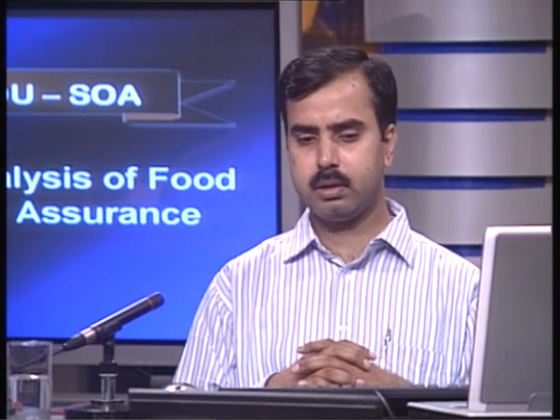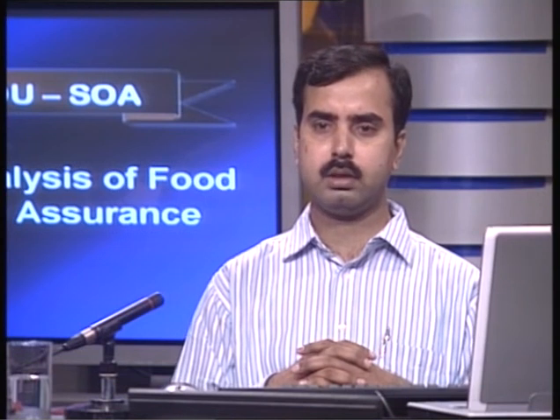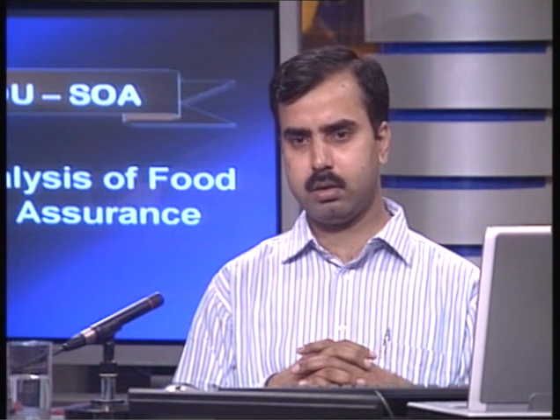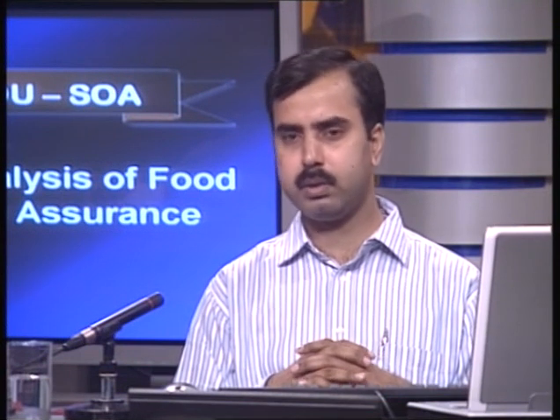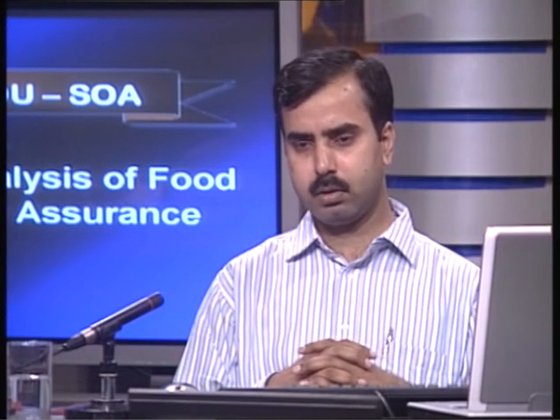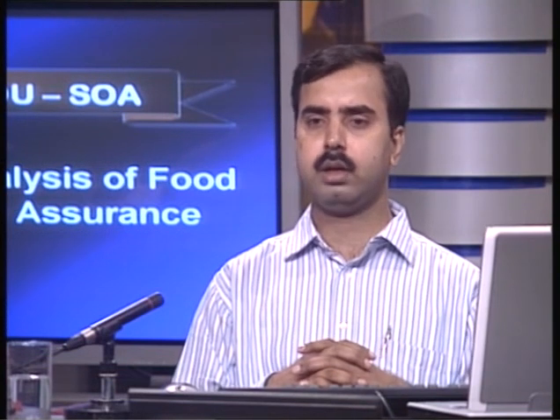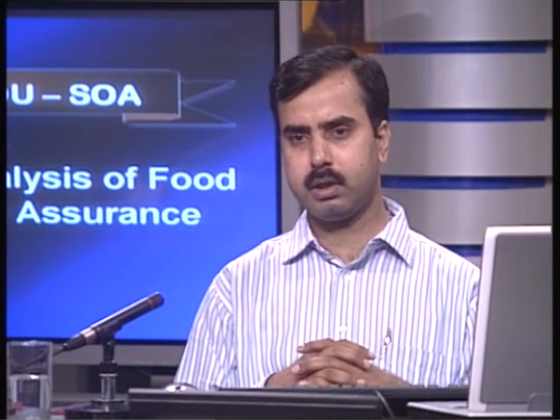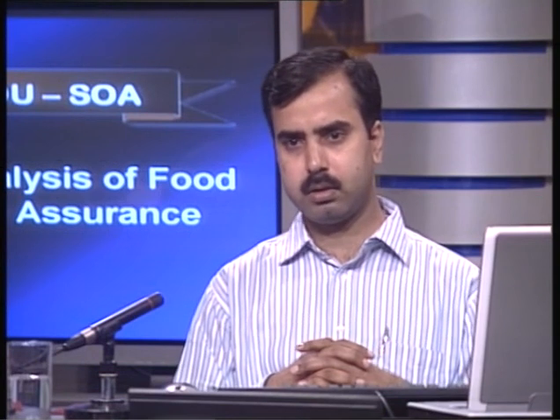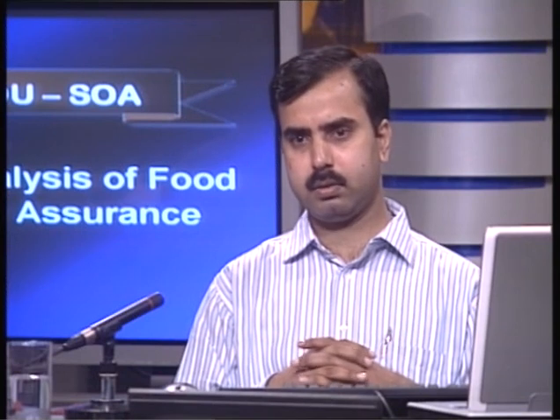But altogether, the heart of an HPLC system is the column, where most of the separation takes place. Basically, whatever analytes are present in the food matrix come to the column, and get attached to the carbon chain present on the silica base. Then, because of the polarity of different analytes, they go through an attach and detach process, and then come out from the column and go to the detector.